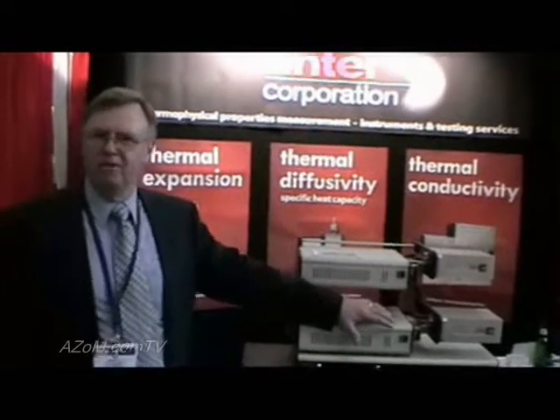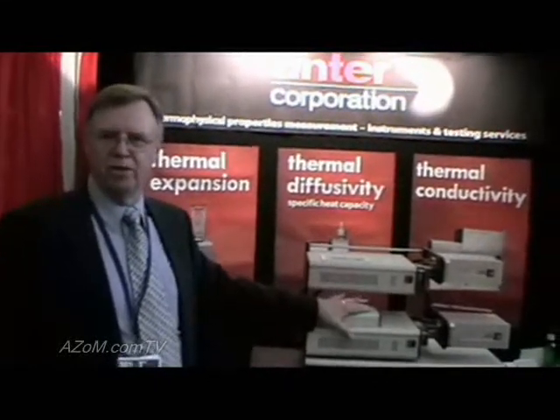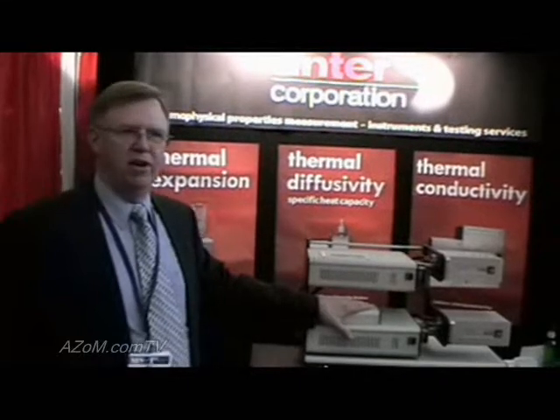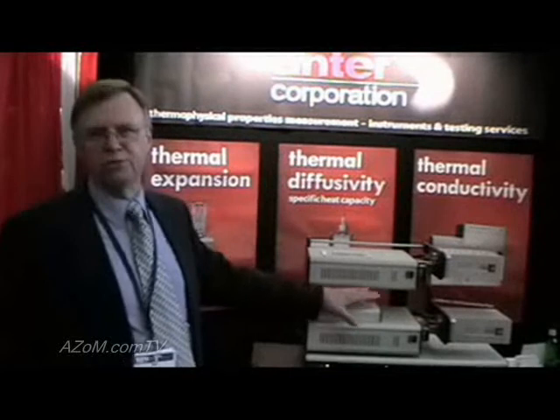Besides equipment, we also have options — different instruments for measuring up to 2800 degrees C, as well as low temperature applications with different models. And our sister company, Andrew Laboratories, also offers testing services with all of this equipment.